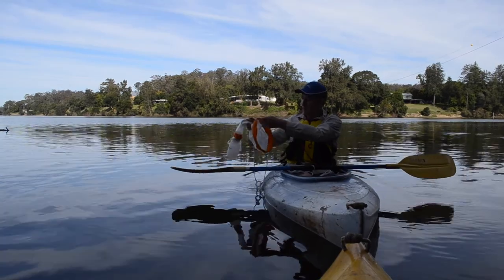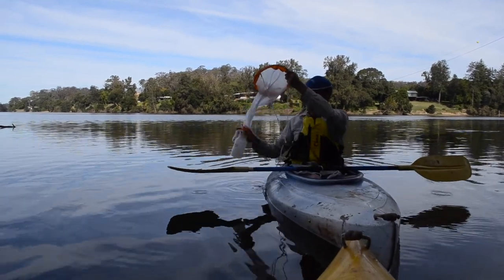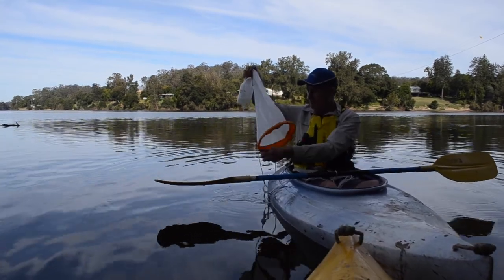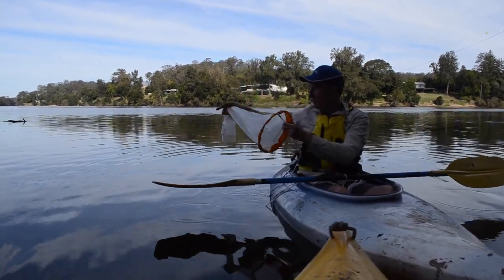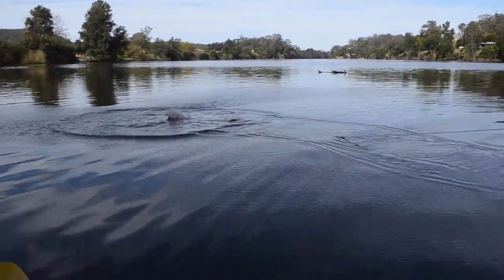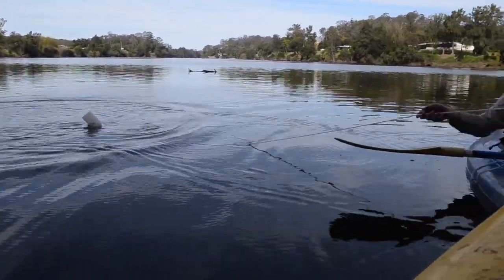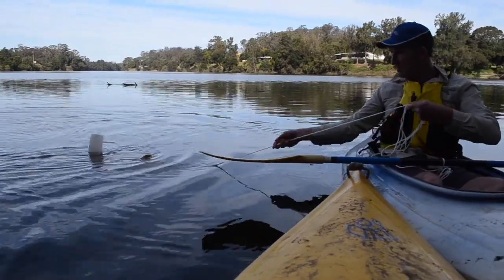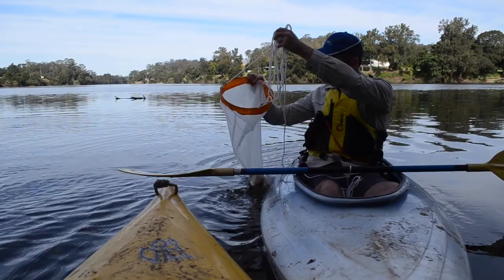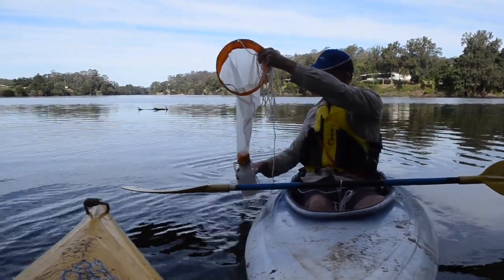We will be throwing them out and dragging them in, and collecting our sample in the bottom bottle. To throw it out, it's best to hold the bottle and the net and give it a throw. Then drag it back towards your boat, picking it up and letting the sample come into the bottle.